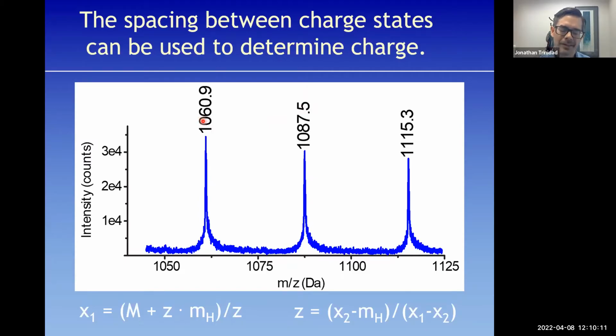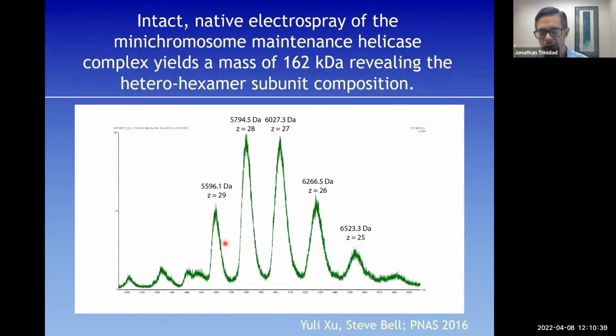And obviously in practice, we have the software do the deconvolution, not because the math is particularly hard, but if you have a more complex spectra than I'm showing here, right, there's really one thing here. Maybe there's 5 PTM modified higher mass forms on the right side of this tail. We don't want to have to deconvolute all that ourselves, so we have the software simultaneously analyze it. All right, and so that's, again, one of the more basic things we do.